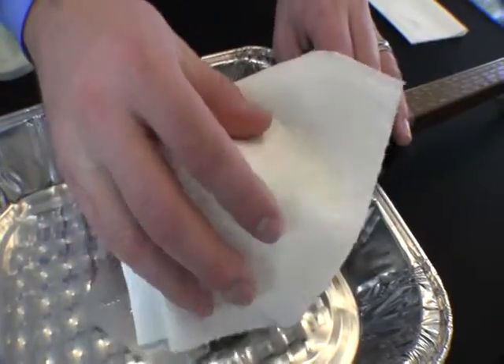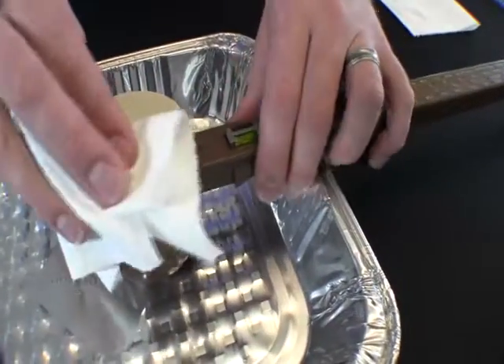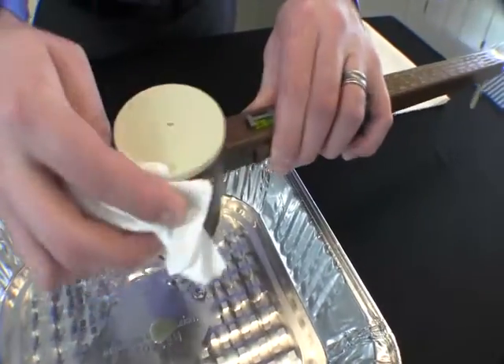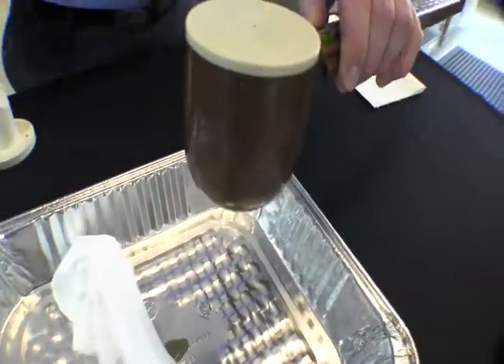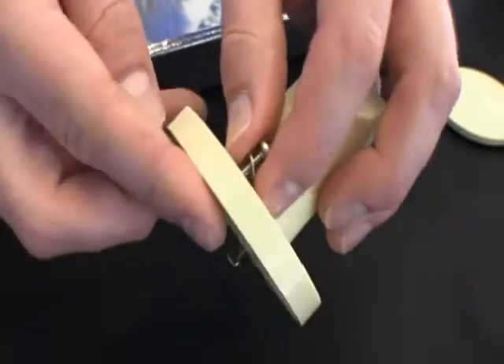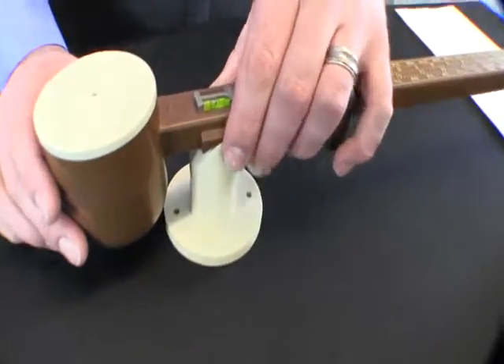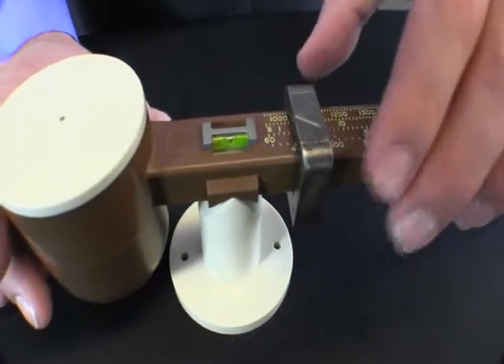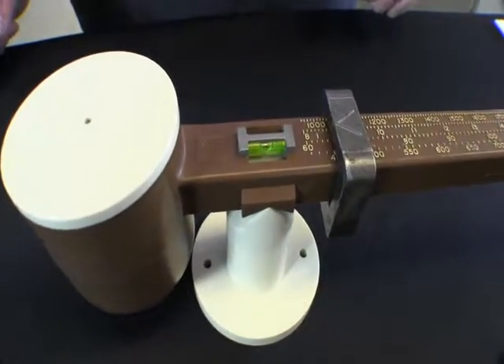Next, wipe the bentonite drilling fluid from the mud balance. Once the mud balance is clean and dry it can be placed on the fulcrum. Remove the screws from the bottom of the fulcrum — this will allow it to sit flat on the table. Place the mud balance on the fulcrum and slide the counterweight to the appropriate position.